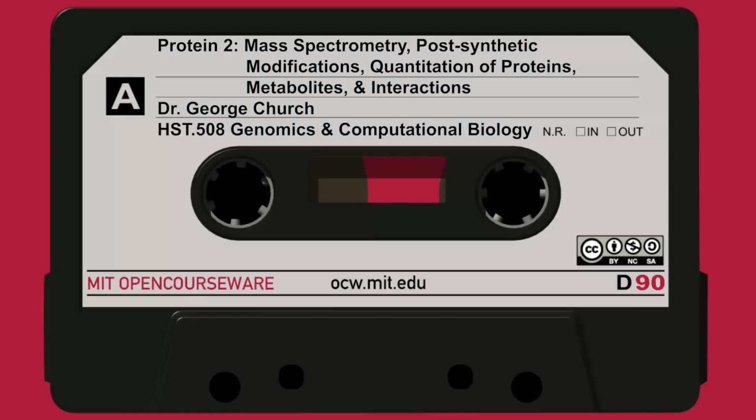And so we have the charge of a molecule, which we talked about last time as being a very important, relatively long-range, 1/r interaction. Here, two methods are mentioned, one involving an electric field, isoelectric focusing, which determines the pH at which the charge is neutral and there's no net movement. And ion exchange chromatography, where we have a mobile phase and a solid phase, and charge enters prominently into that.